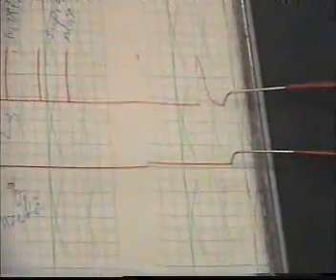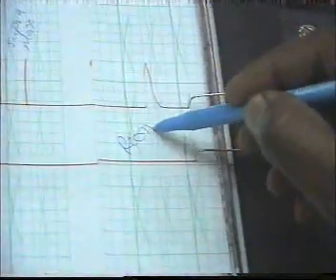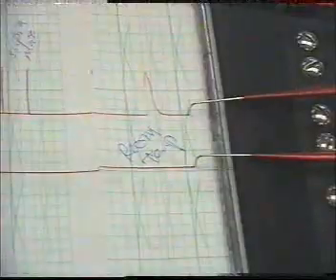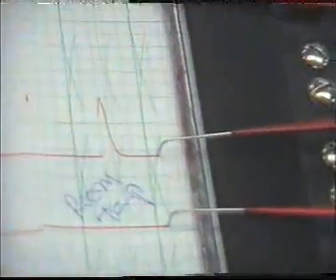Let us see the effect. Okay, this is at room temperature. Cold. الآن, now we add cold ringer solution.